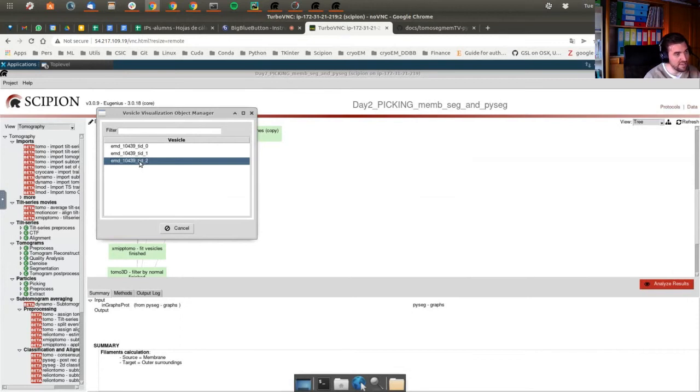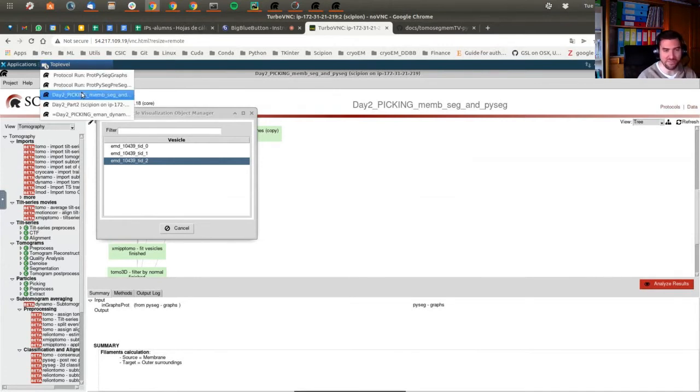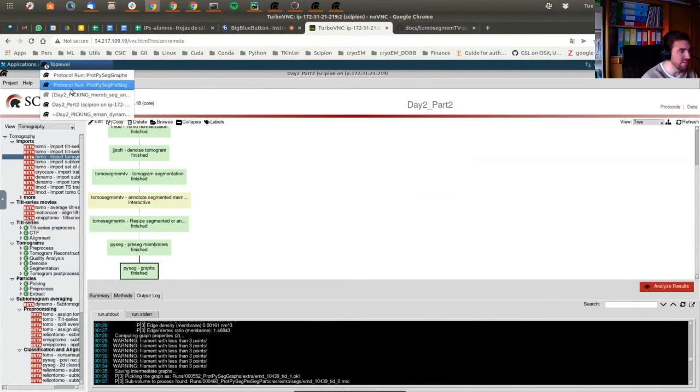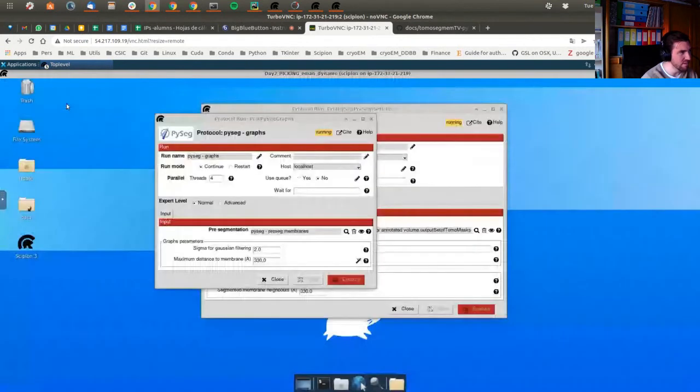This delay seems that my graphs hasn't finished yet. Sure. Oh yeah. I'm in your club now, Dimitri. I'm in your club, man. Look at this. Okay. It was much longer than expected. Yeah, as you can see, it seems to be slow.